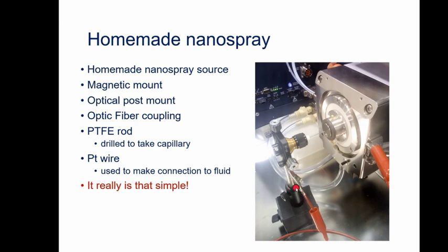The way the Bruker system is set up, actually, the needle is grounded, and the front of the instrument is at high voltage, which is the opposite of what you normally see. One other thing of interest here is that black thing at the bottom there. That's just a pipette tip stuffed into the interlock switch.